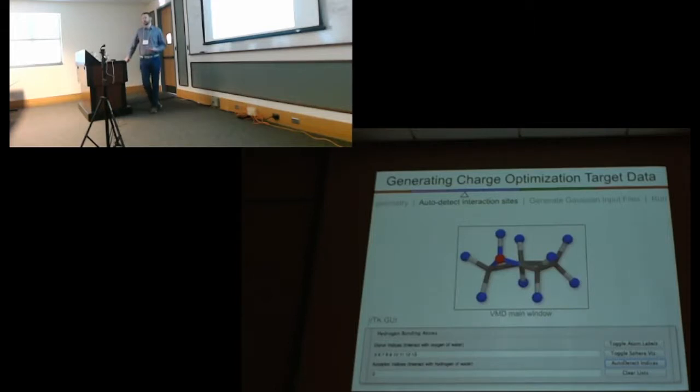Another feature of FFTK is because it's a plugin within VMD, it really works with the graphical capabilities that VMD provides. In the main VMD window you can load in your optimized structure and visually see it. The first thing we have to do is define the interaction sites where the water can interact with the molecule. These come in two flavors: hydrogen bond donor, where the oxygen is interacting with your site, or hydrogen bond acceptor, where the hydrogen is interacting with your molecule. We provide auto detection which can rapidly assign different interaction sites.